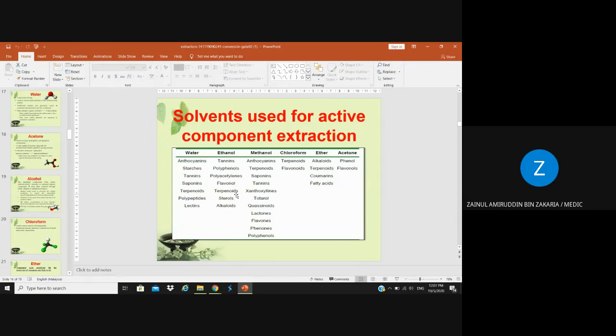What you need to do after that, you put petroleum ether also in the mixture. Then you shake again. So what happened? The non-soluble part, when you put water, that non-soluble part will dissolve in petroleum ether. But because of the presence of water, petroleum ether and water will not mix. So they will be separated into two layers. So you take out the petroleum ether part because that is the non-polar part, but in the water part, there are still highly polar and intermediate polar compounds.